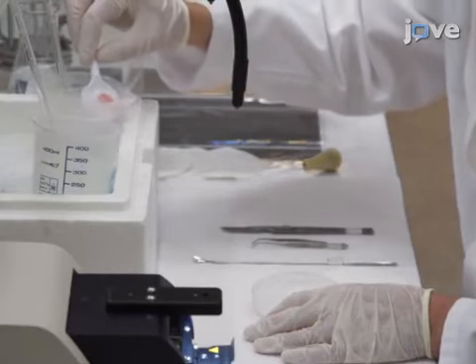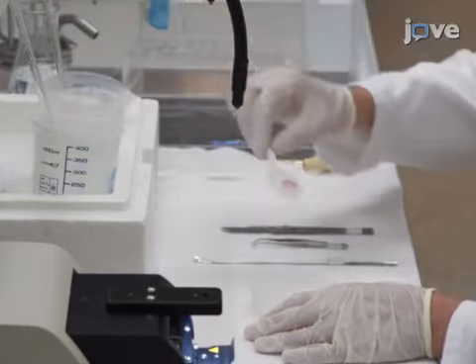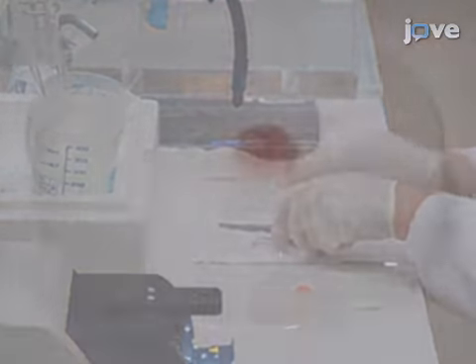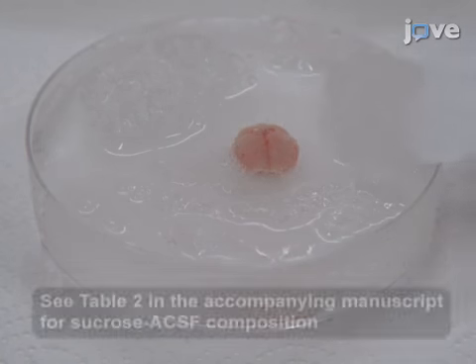Begin this procedure by placing the brain on a 9 cm petri dish with the bottom covered with a layer of Silgard. Next, surround the brain with ice-cold sucrose ACSF.